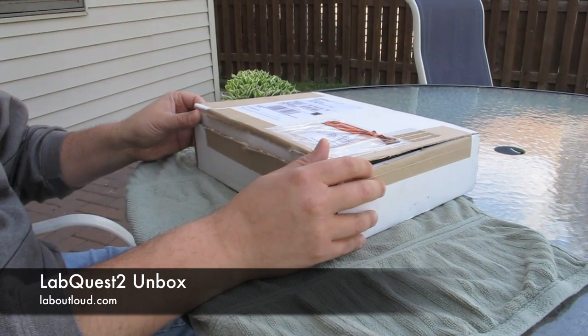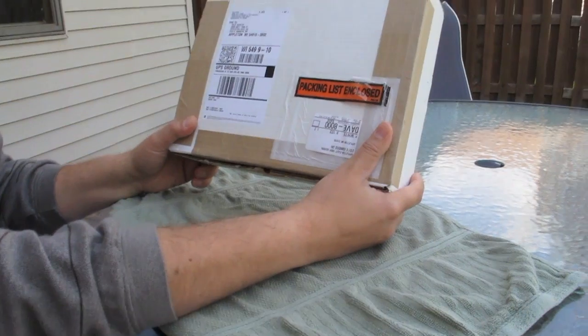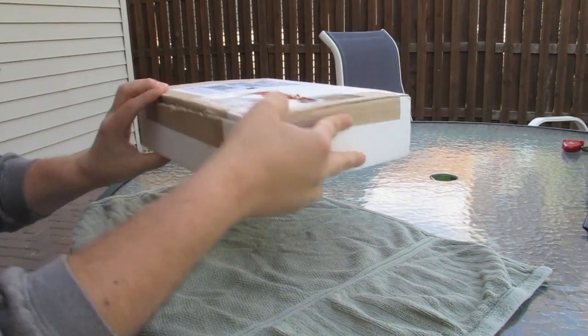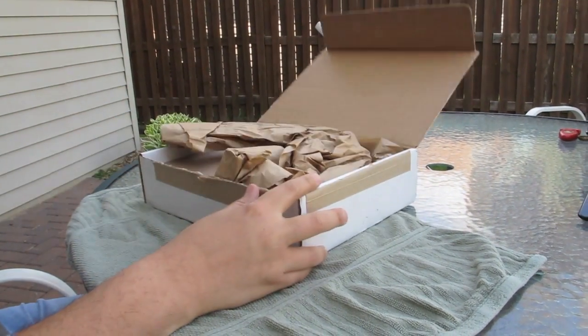All right, this is our first Lab Out Loud Backyard Unbox, looking at a healthy product. If you've ever ordered from Vernier, it should be a tell-tale sign — this is the quintessential Vernier box. Voila!